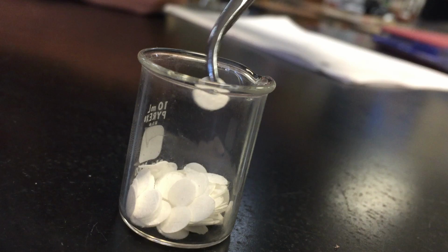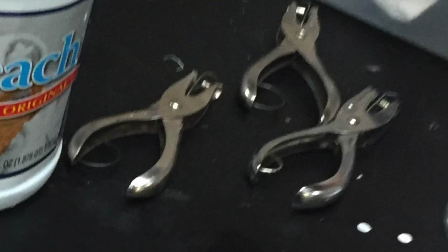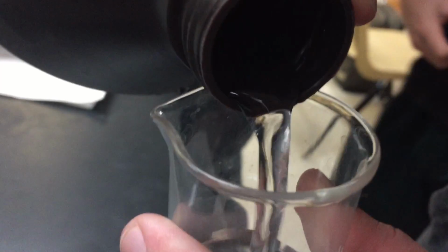Materials: hydrogen peroxide, paper chads, potato catalase, stopwatch, hole punchers, and tweezers and beakers. Okay, procedure. Fill a 50 milliliter beaker with 30 milliliters of hydrogen peroxide. For a control, we put a chad in a beaker with hydrogen peroxide and no catalyst. In this experiment, the chads did not float.